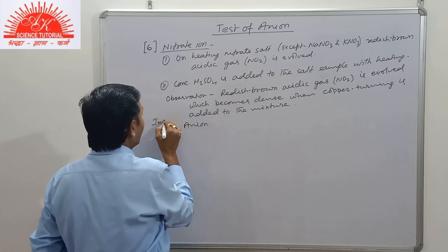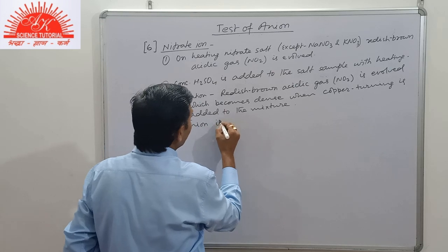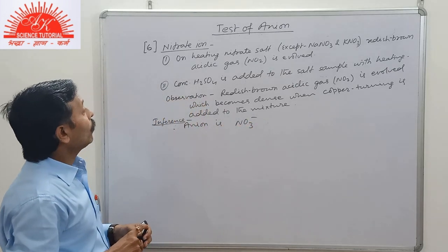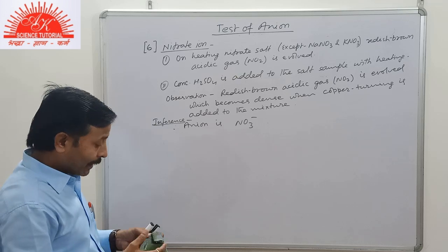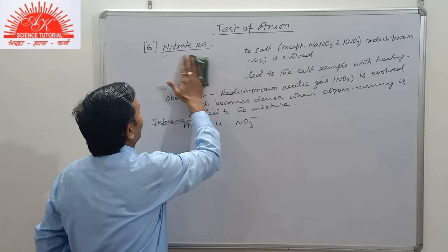The inference is that the anion is nitrate ion. So we can have this second test to identify the nitrate ion.